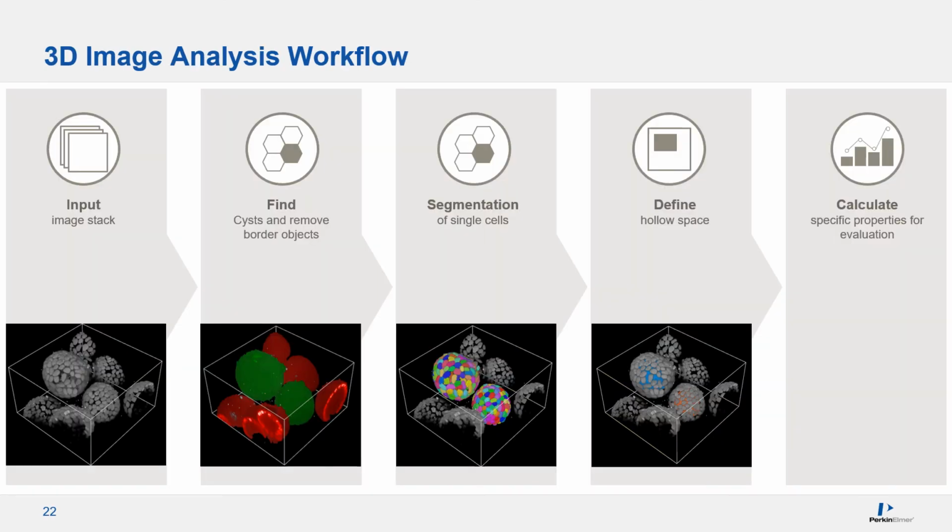The workflow for image analysis is similar in terms of 2D or 3D data. First, you input your image data, and then you find your object of interest, followed by segmentation, and then you define your region of interest before quantifications on the different parameters of interest.